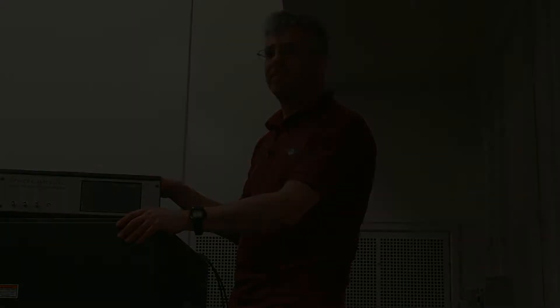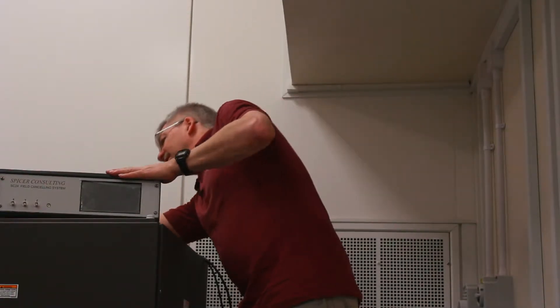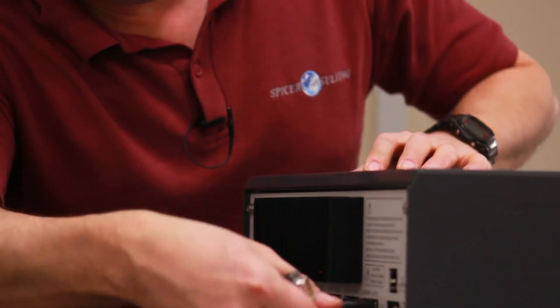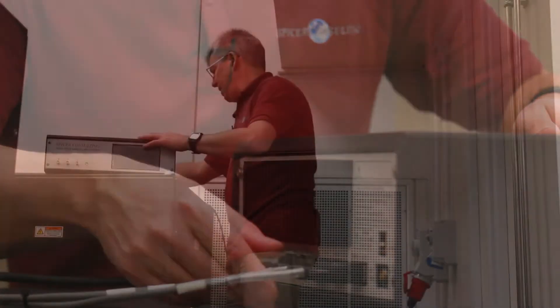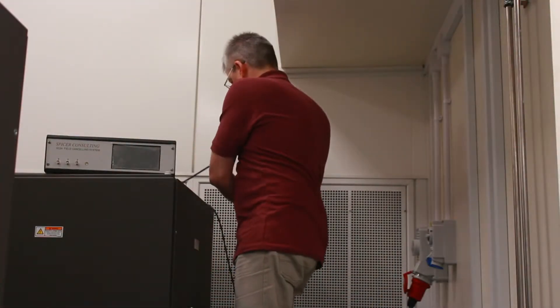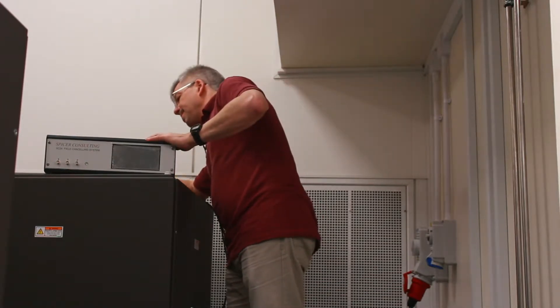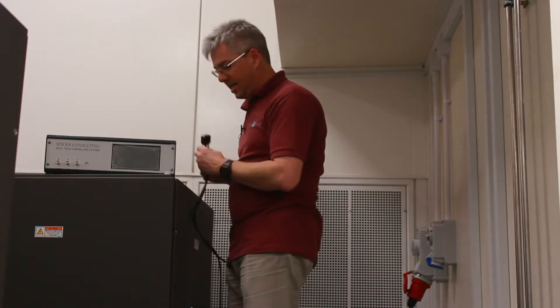Now it's time to plug them in and see how it all works. First the sensors, then the field cancelling cables — X, Y, and Z.